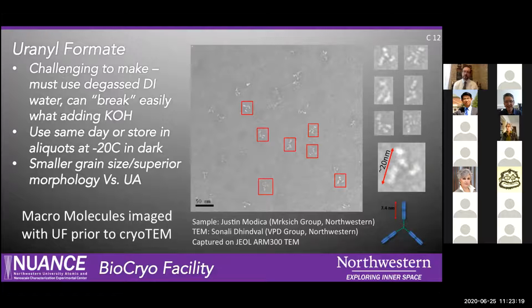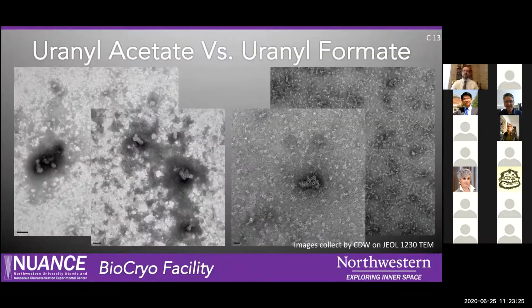You can really see in this comparison some of the higher resolution. I feel like this is not a completely fair image for uranyl acetate because it isn't actually a very nice stain. These are actually the same sample.